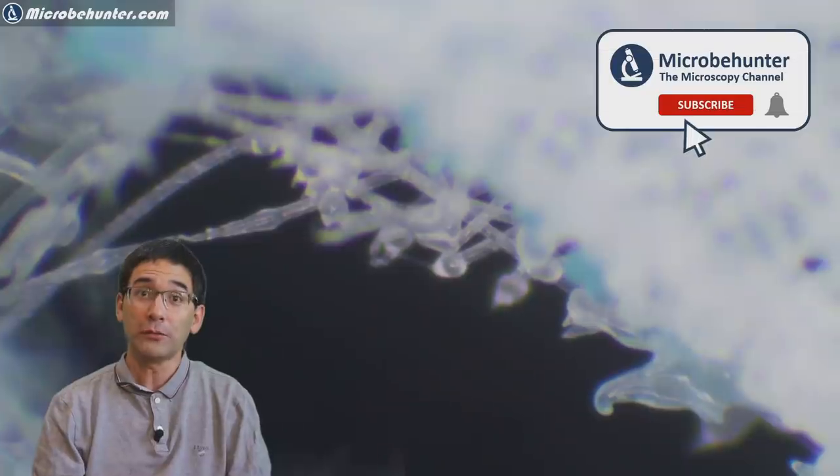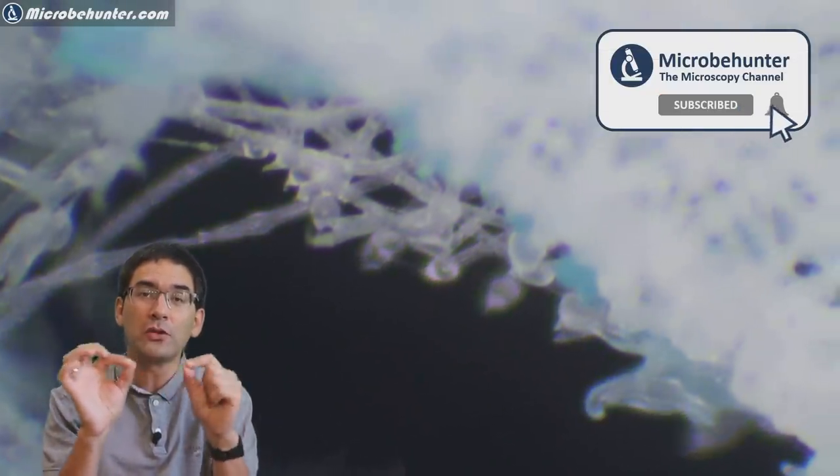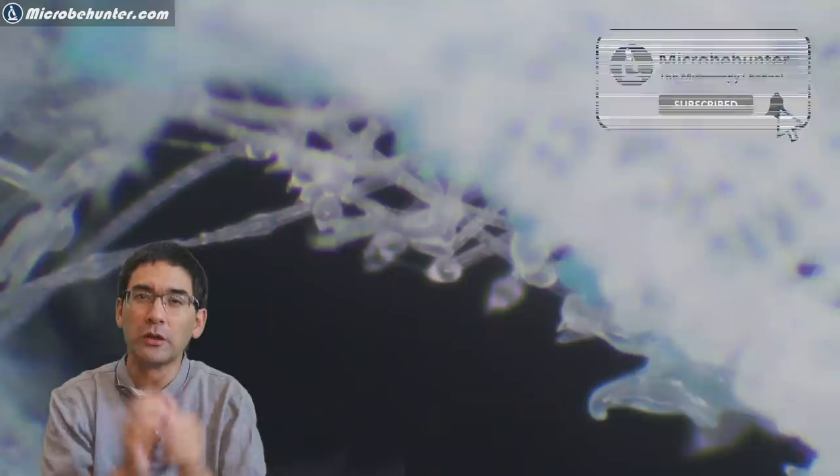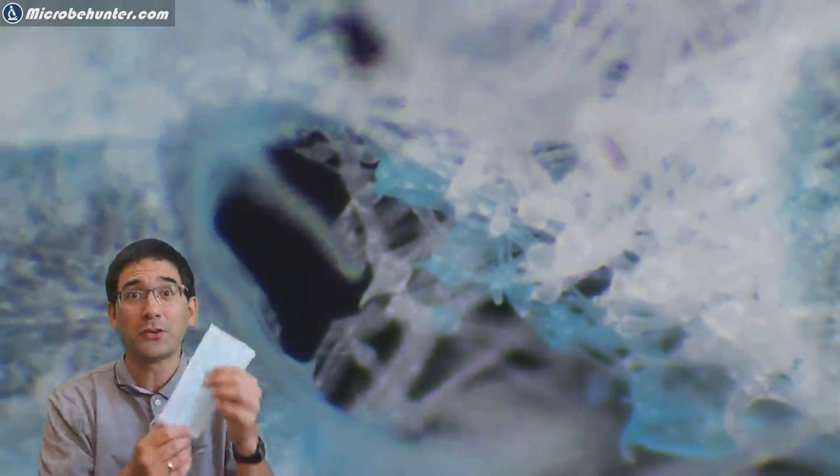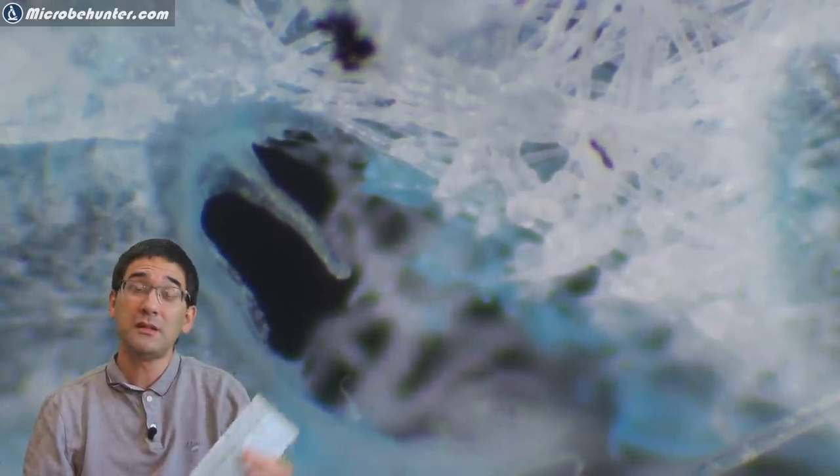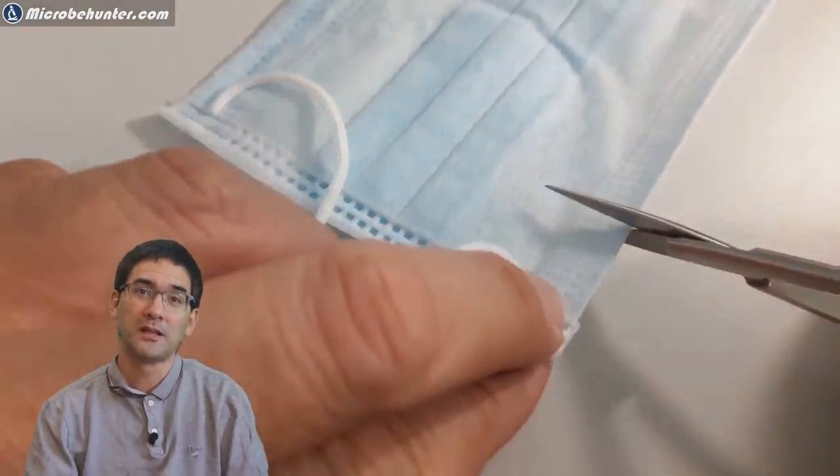Under the stereo microscope you can actually see that the ends of the fibers started to melt and you can see those circular little buds. It really looks like it has molten. I'm a little bit worried about that because this actually means that these face masks are not biodegradable. You cannot simply throw them away in nature. You have to properly dispose of them.